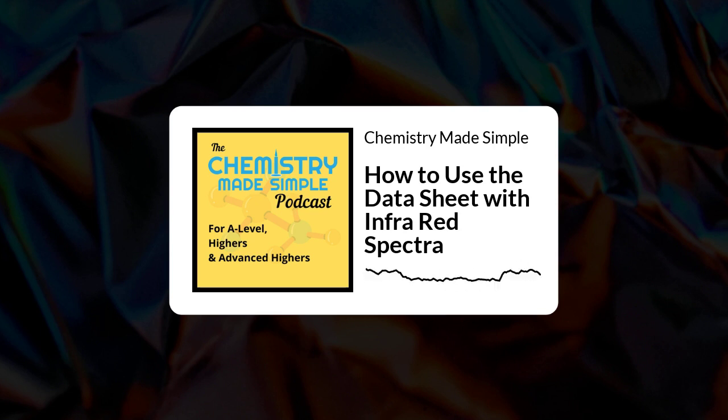Are you expected to remember all those? Well, no, you don't need to. Certainly if you're studying chemistry at A-level in the UK, you'll be given a data sheet if you're doing an exam. You'd also find a data sheet in your textbooks as well. And that data sheet will include a section on infrared, and within there you'll find a number of known peaks and bond types and a description to help you identify the bond types and even compound types that a particular peak would indicate.